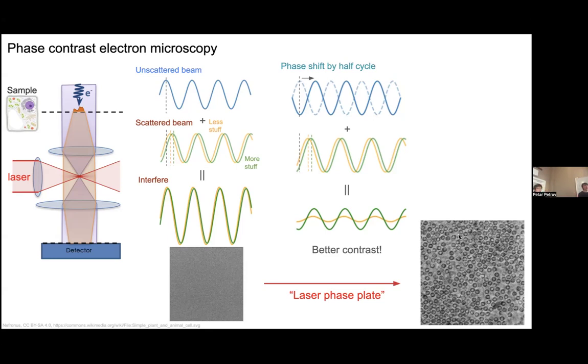And with the spherical aberration corrector, what that also enables you to do is really get rid of any loss of phase information, so that you could collect all of the phase information in the image. In that case, you would have pretty much everything there is to have. So a ballpark is that at the low spatial frequencies, the image is about 100 times better. You would need to take 100 times as many of these images to get a similar amount of low spatial frequency information. Of course, you can't actually do that because you would completely destroy the sample. But that's the case where the phase plate looks like the best: it's about 100 times better at these low spatial frequencies.